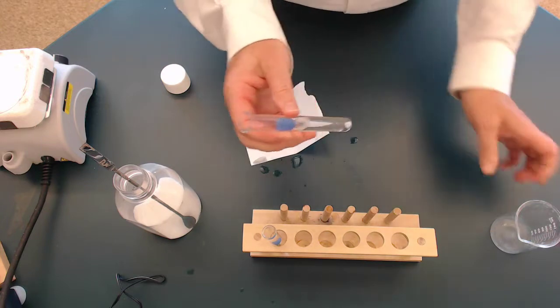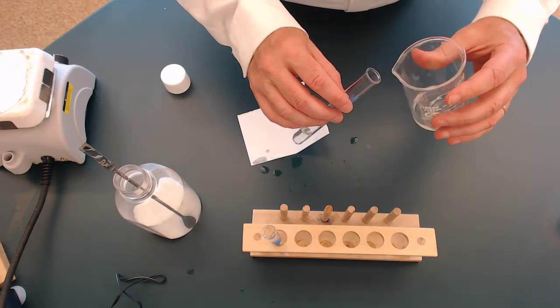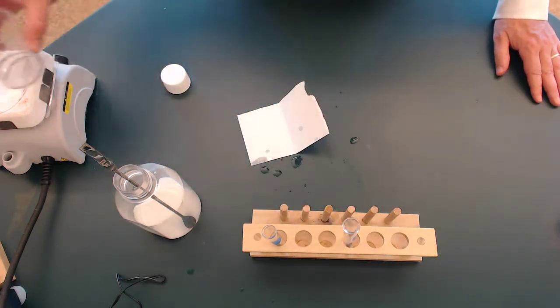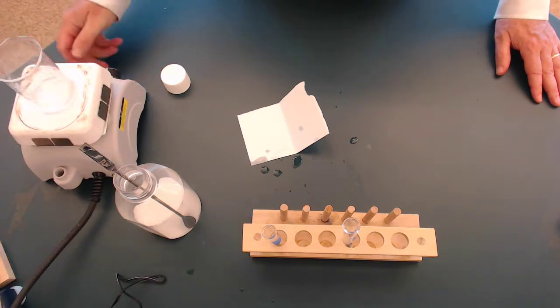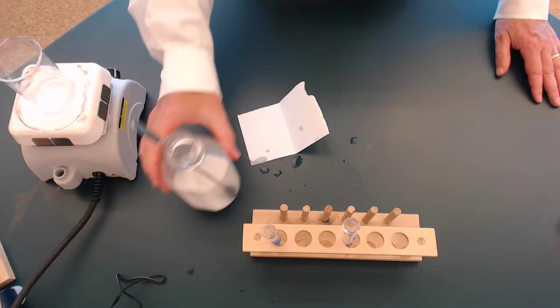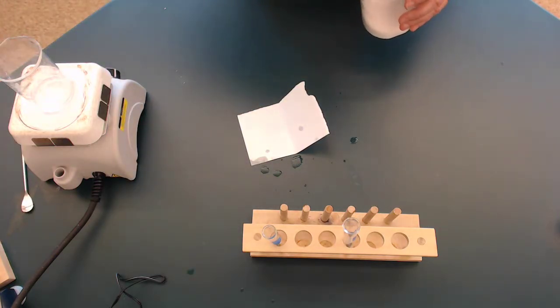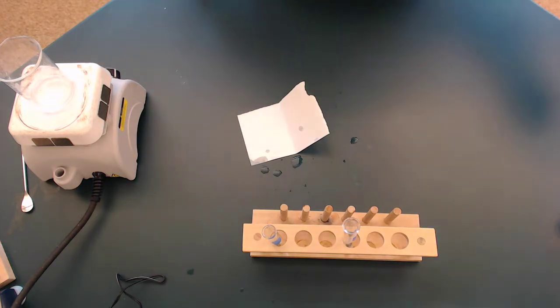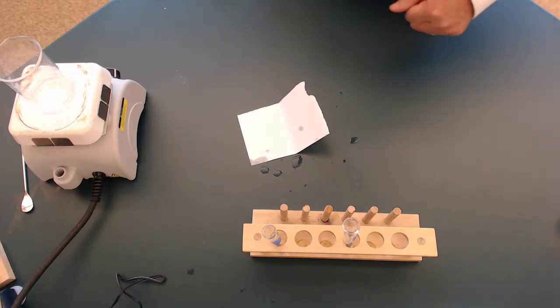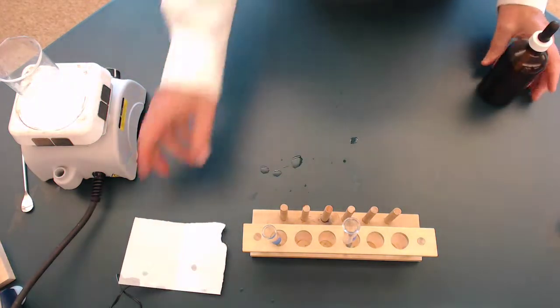The next part, we're going to take this, and we're going to pour half of it. That's a little more than half, but that's probably perfect. We're going to pour half of it in a beaker, and we're going to put it over here on a hot plate. And we're going to see what happens when I boil that. Then, in 1C, we'll let that boil.